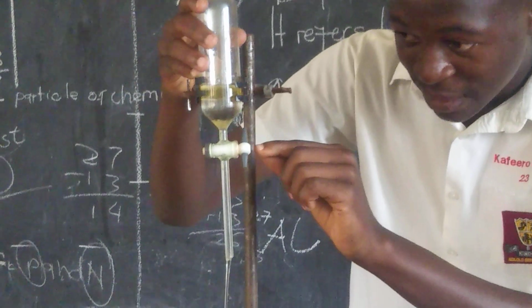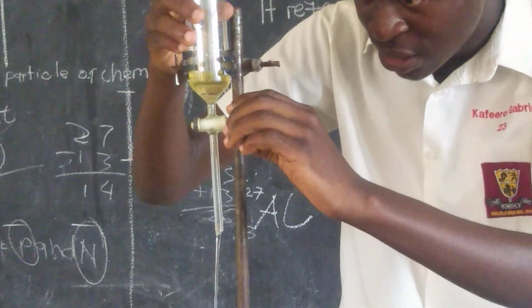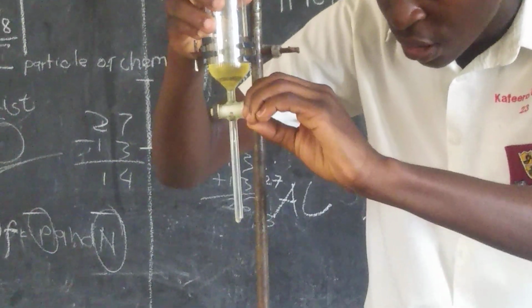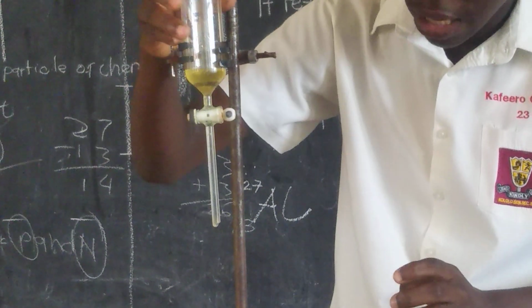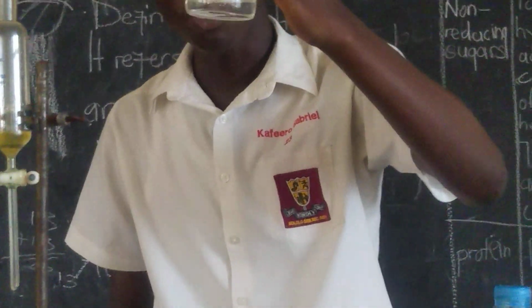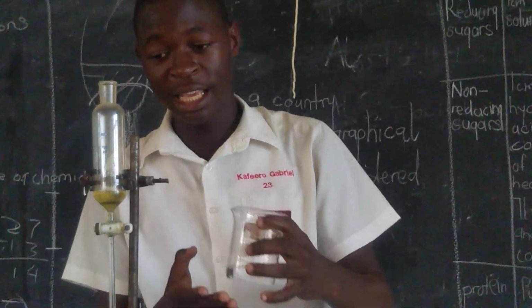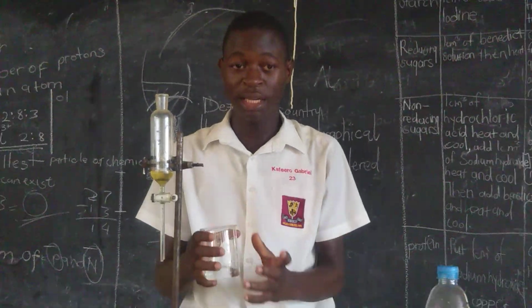So we have to time it, not until it reaches near the spout or the outlet, such that we can close it. Yeah, so that's it. Now we have closed it. Now this is our plain water that we poured at first in order to make sure that we can see the layers and how this thing can be separated.